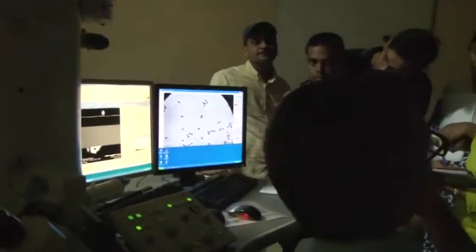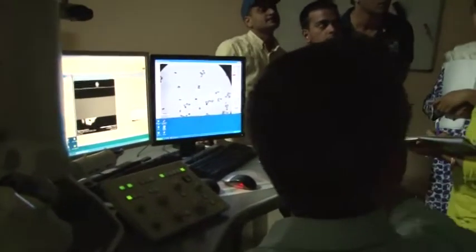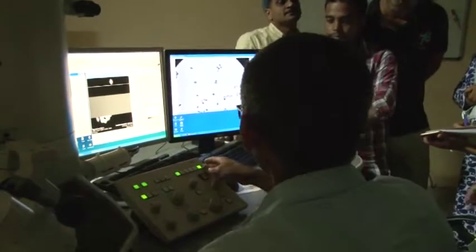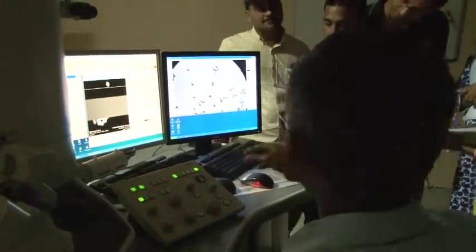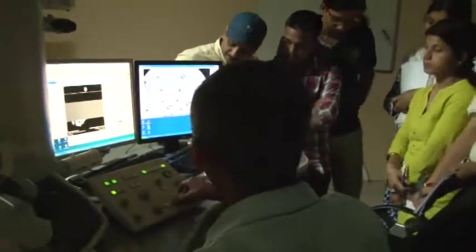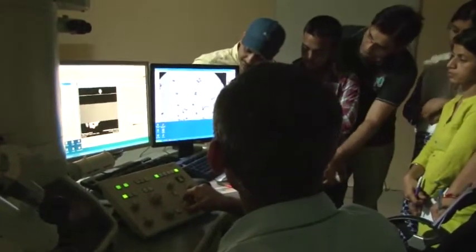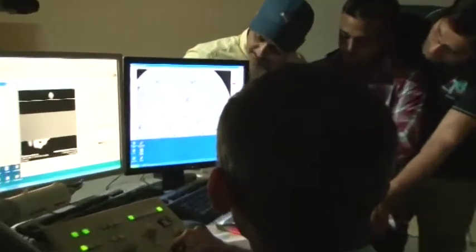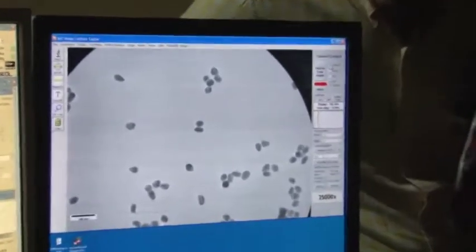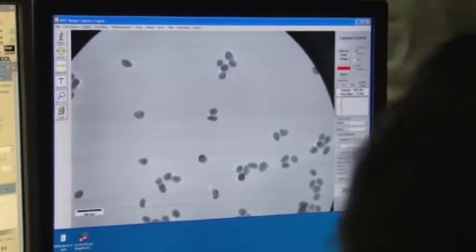I wouldn't show it on the camera because you have a very small number of particles. The direct beam is very intense, and the scattered contributions are pretty weak. I think it's some defocus again. So let's see. Yes, they were slightly defocused, and now they have overfocused.